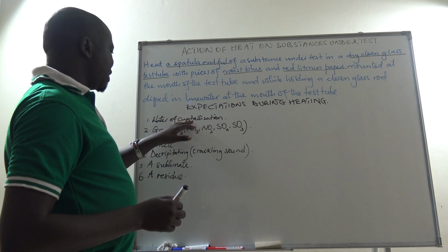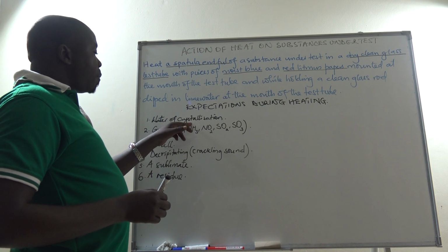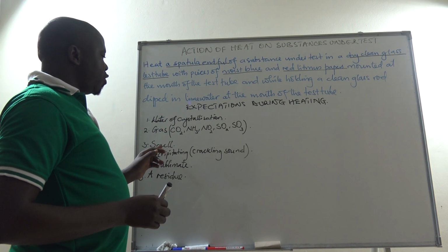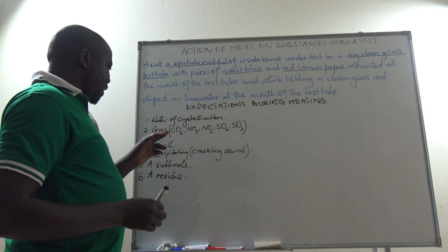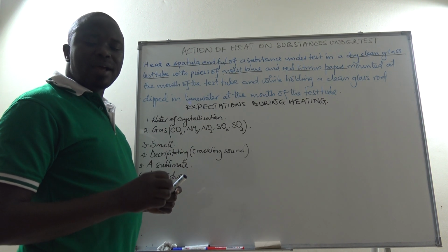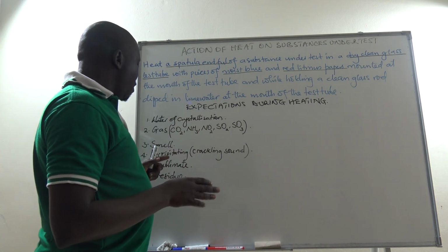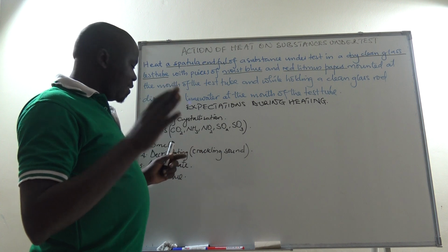Water of crystallization, a gas, and that gas may also be coupled with a smell produced during heating. Then we expect a crackling sound, that is some minor explosions due to decomposition or breakdown of the solid which you are heating.